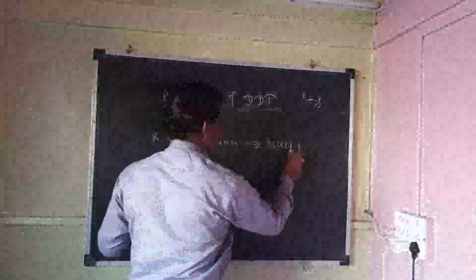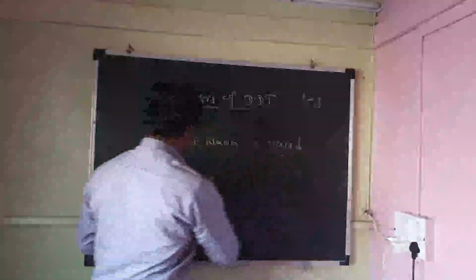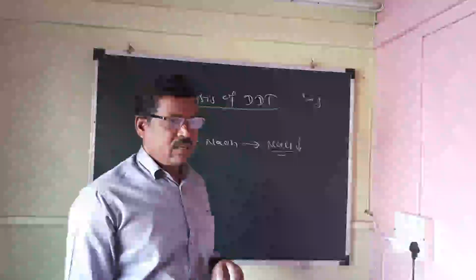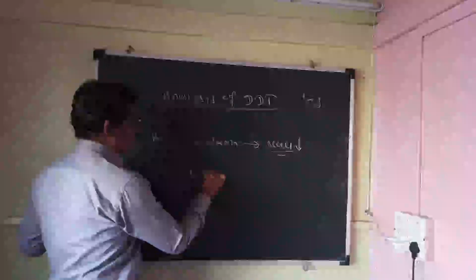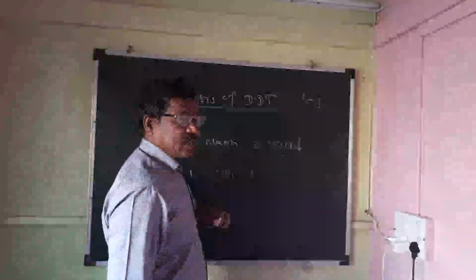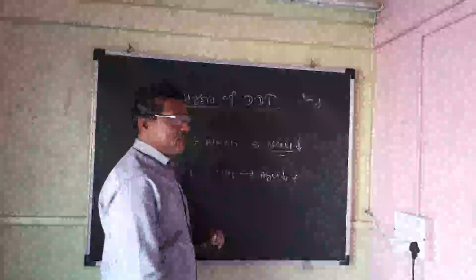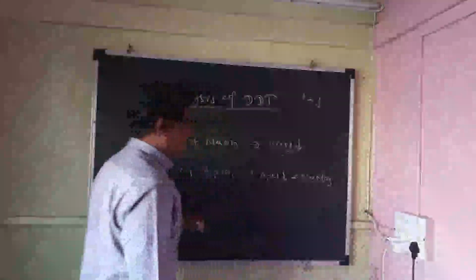This NaCl is liberated, and this NaCl, by using Volhard's method or Mohr titration method, a precipitation titration method, is titrated with AgNO3, silver nitrate, to give the white PPT of silver chloride, AgCl, and sodium nitrate, NaNO3.